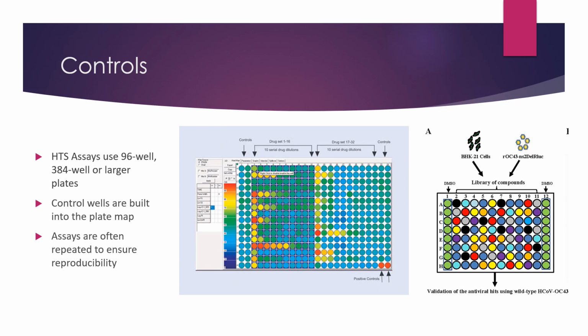The assay design is optimized for a 384 well plate and for 10-point drug dilutions. The most efficient design is to use 2 blocks of 16 drugs, leaving 4 columns available for negative and positive controls. This allows 32 drugs to be tested on a 384 well plate.